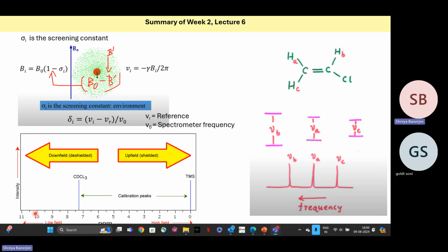So in the NMR plot that you have, in the x-axis, you have this chemical shift plotted. And the formula of this, so you take a reference compound, something like TMS, which we discussed in the previous class, and we take the frequency at which TMS is excited as nu R, and nu i is the frequency of the sample peak that we are looking at.